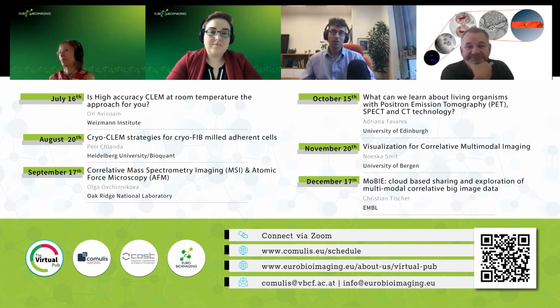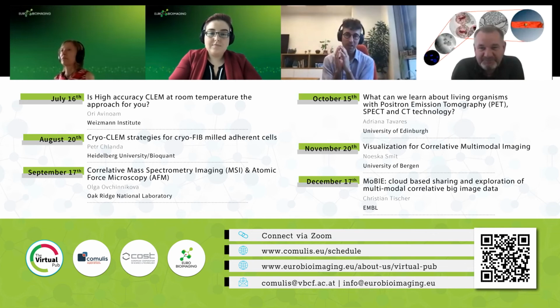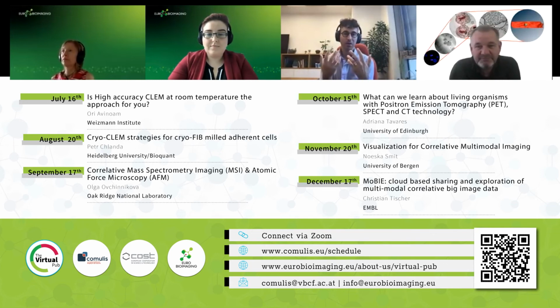Okay. So let me see if I understood. One part of the question is to understand what is the time frame if we were to image the cells live, how quickly can we cryo-immobilize them? First, just let me clarify, in the main paradigm that I presented, the cells were fixed before I ever imaged them, meaning I already have learned a lot about the fluorescence and the behavior of clathrin versus dynamin, and I use that as a surrogate for time later on.